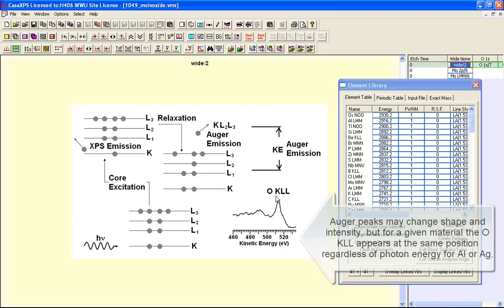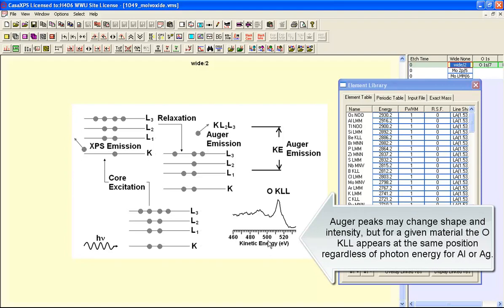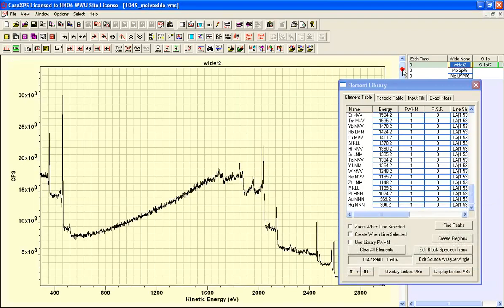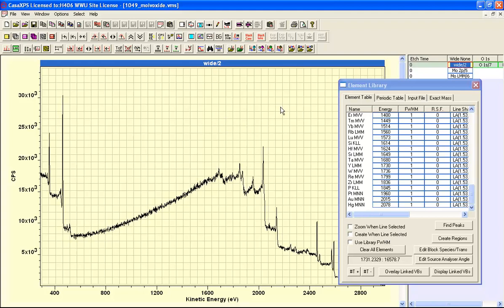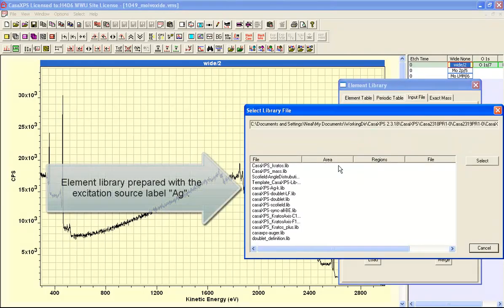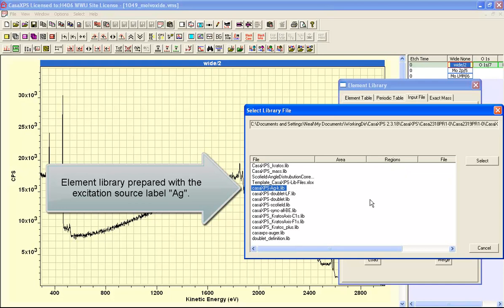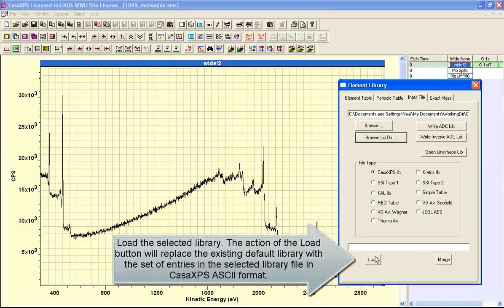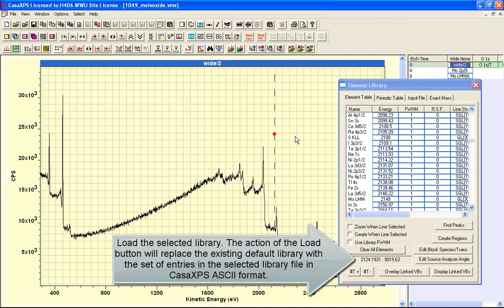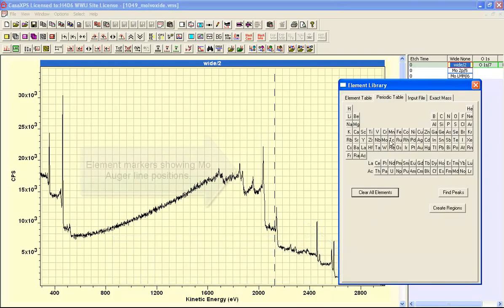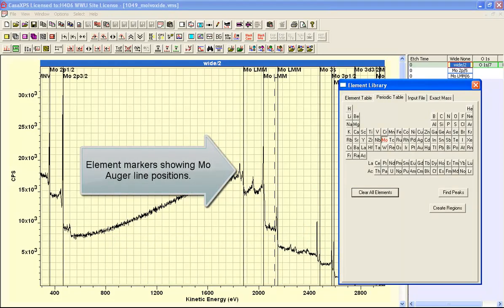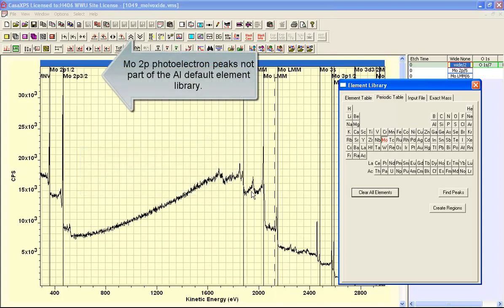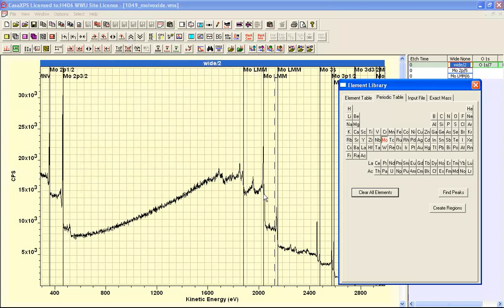Hence the Auger from oxygen always appears at the same kinetic energy in a spectrum. While the Auger lines are always available to us we'll have to load an element library that corresponds to a silver anode. In the CasaXPS.LBD directory there's an element library that has been set up for these photoemission lines from a silver anode. I select this and load and then display from this library. Let's select molybdenum. We get a set of photoemission peaks that complement the Auger lines. We've still got the oxygen Auger line here.